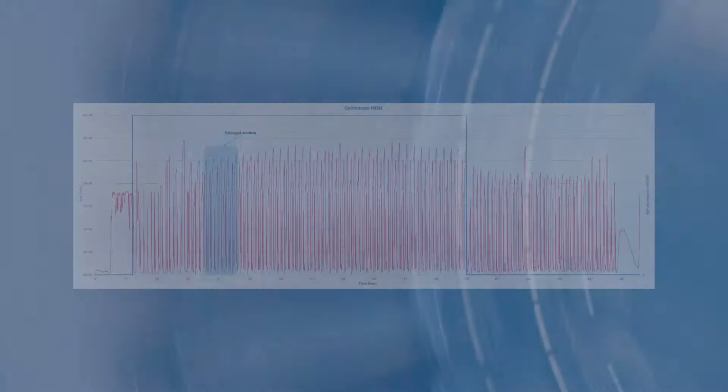Continuous injection in MDM offers increased efficiency compared to batch processing, allowing you to save even more on expenses. Productivity can be increased more than threefold compared to batch processes, without any significant change taking place in solvent consumption. This allows users to have much more productivity and throughput, with operational costs and hourly solvent consumption remaining largely unchanged.